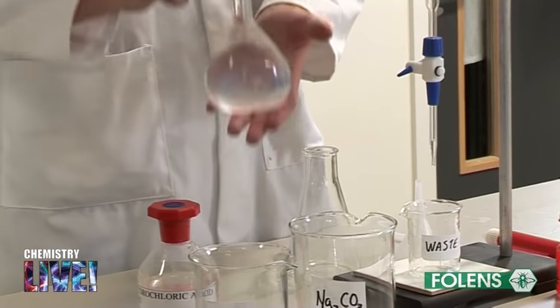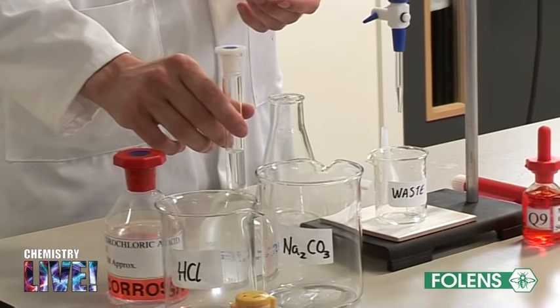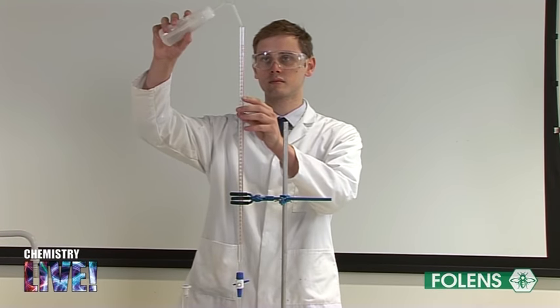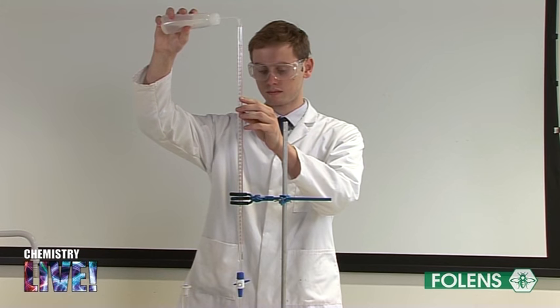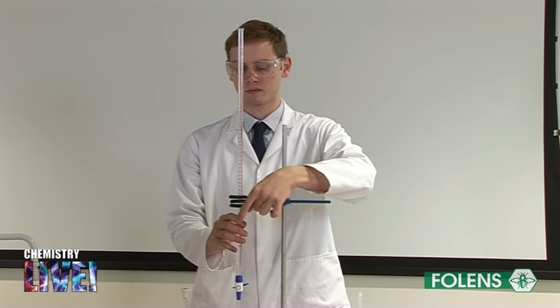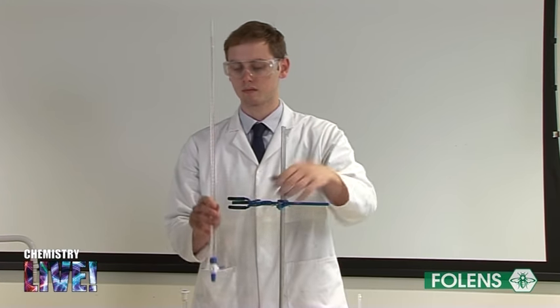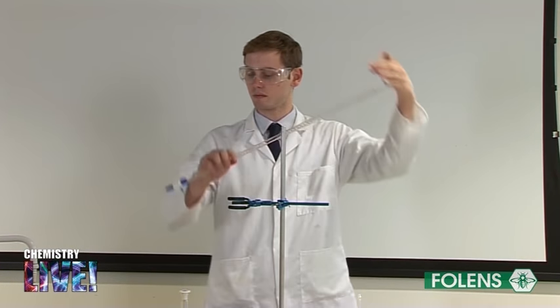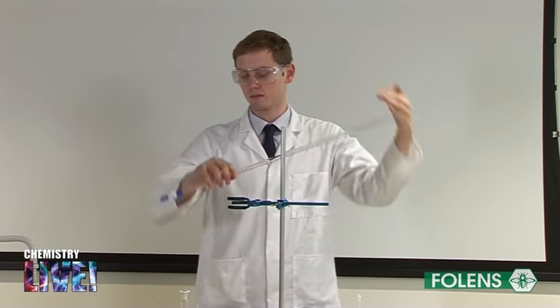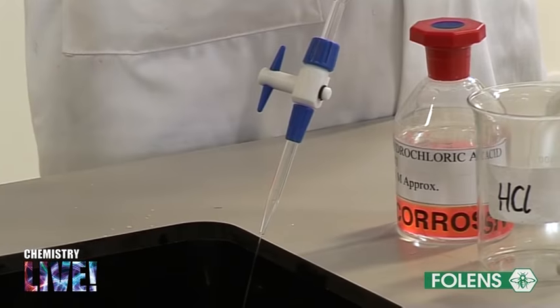By titrating the given hydrochloric acid solution against a known volume of sodium carbonate solution, whose concentration is accurately known, we can determine the concentration of the hydrochloric acid solution. Wash out the pipette, burette, and conical flask with deionized water. This removes any impurities present.